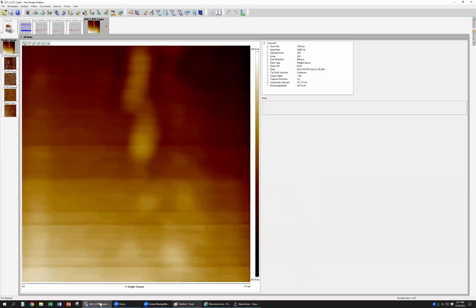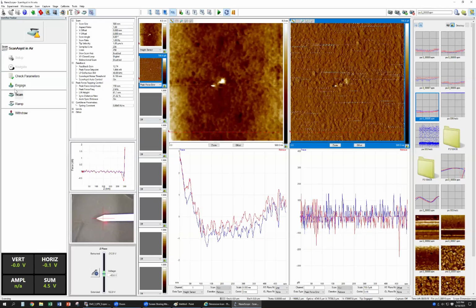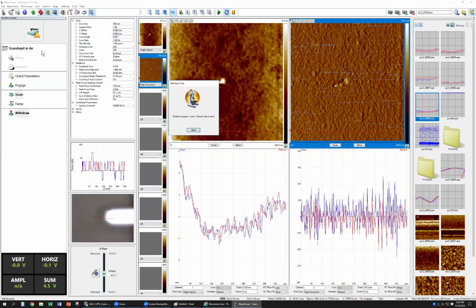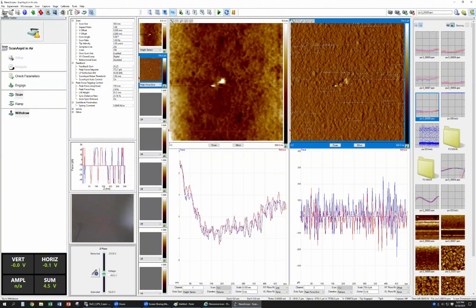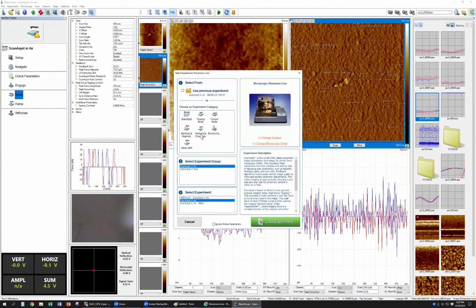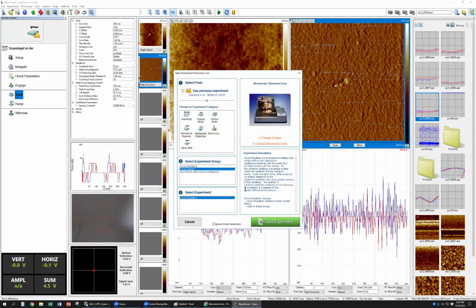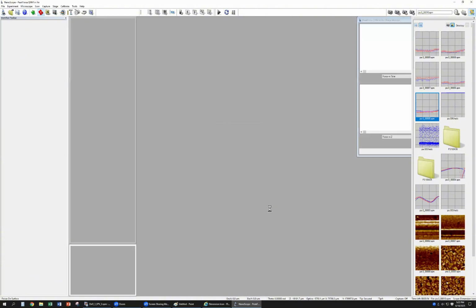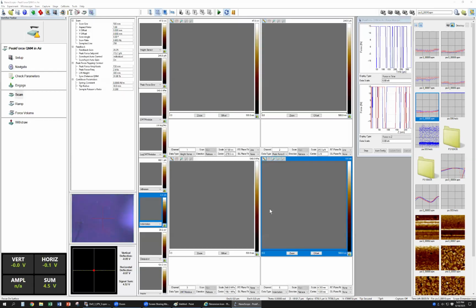Then we can go back to the software, put on your sample to measure, and then you get the modulus image you want. It's clear. Okay. Three parameters only: deflection sensitivity, K, and R.